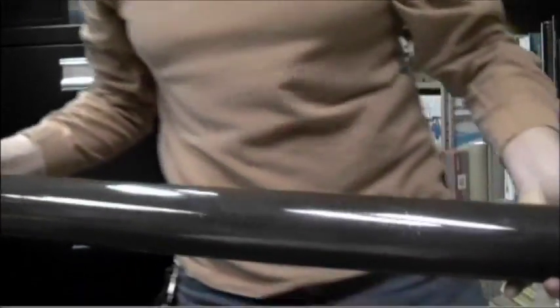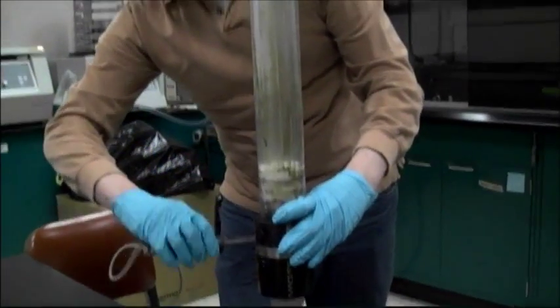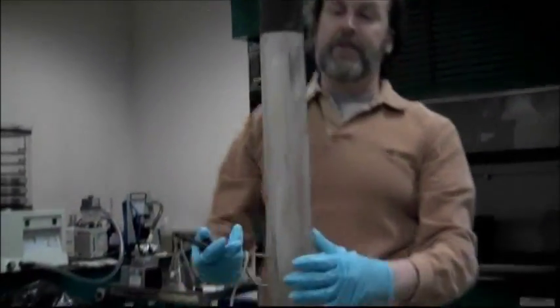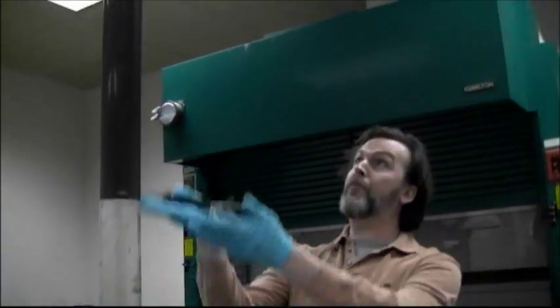On the surface. Just tightening the whole core in place. So the whole idea here is we now are going to extrude the core upward and we are going to scrape off sediments from the top as we lower this a centimeter at a time.